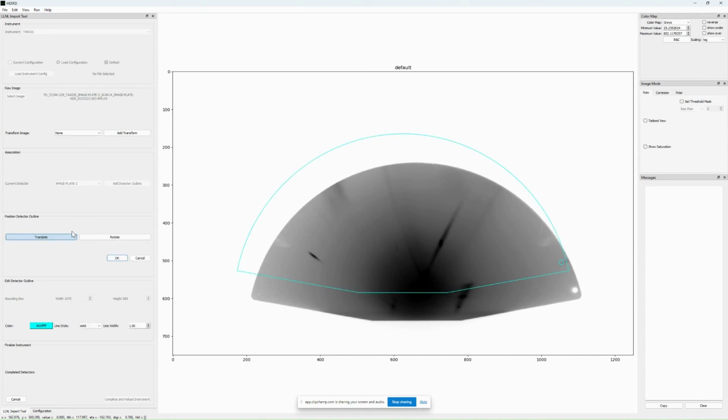I still selected rotate. So let me do translate again. Here we go. Yeah, that one's a head scratcher, and we'll get that fixed soon. But the good news is that for some reason, with the current version of Matplotlib that we're using, the rotate after applying the transform this way makes the outline disappear.